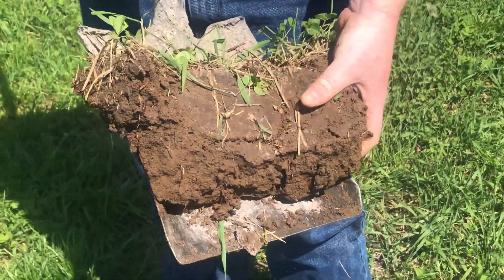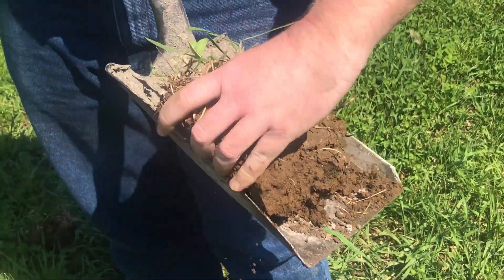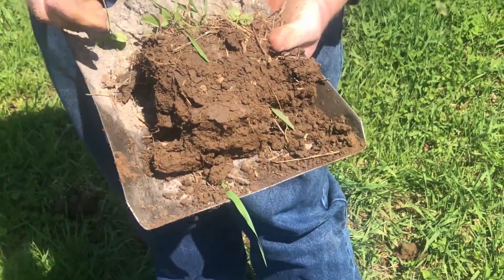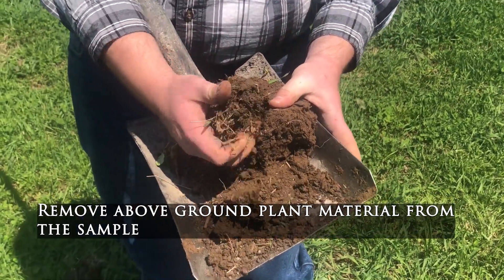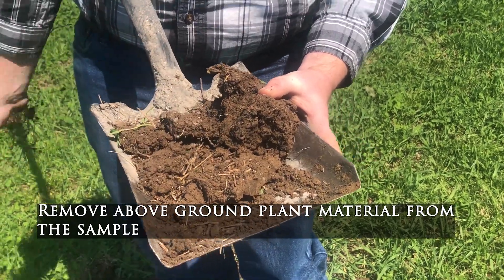When we have removed the soil slice, break off the outside edges. Remove any plant material that may be present, and retain at least a 1-inch core out of the middle of the slice for your composite sample. This is a good time to begin mixing your cores for a more accurate test.